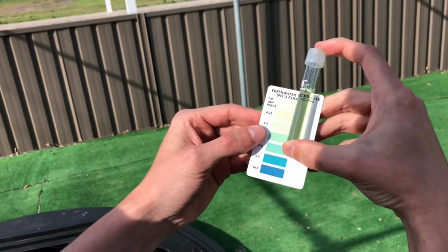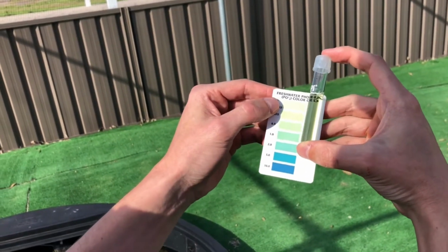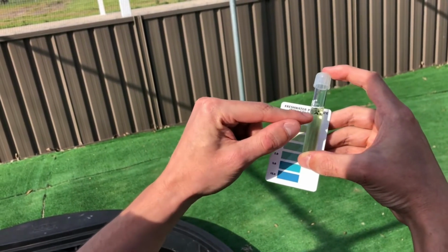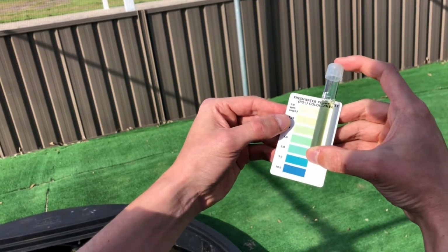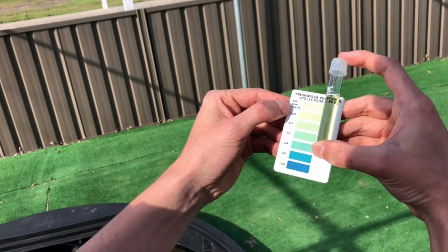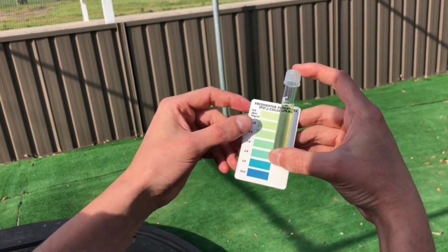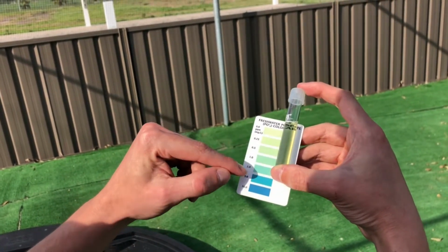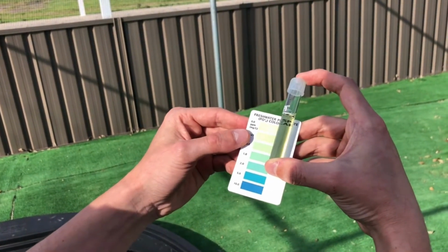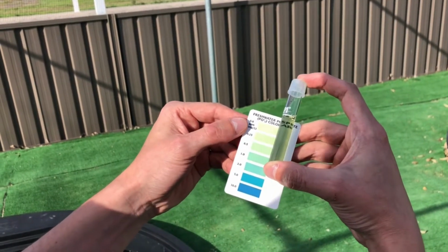So after 3 minutes, we've got our sample, comparing it with the phosphate colour card. You can see that the sample is very light, which is representative that there's a very low amount of phosphate in the sample. It's definitely not a high amount, as the sample would be a lot darker than it currently is. So I would record this sample as 0 ppm or parts per million.